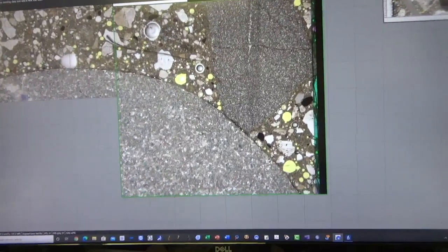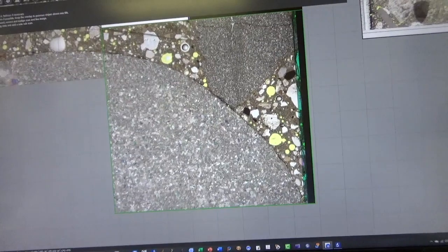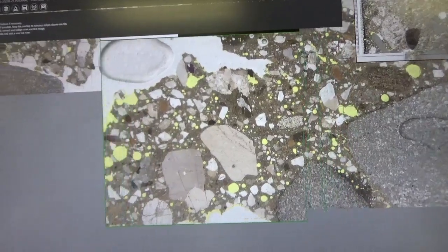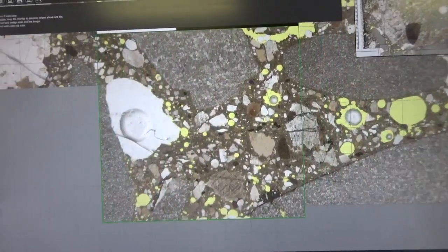Although this manualWSI software will give you a scale bar at the end of the scan, when you save it, it will give you an option to save in the JPEG mode or TIFF mode or JPEG with scale bar. So you can have a scale bar at the end of the scan. But if the image is too big, then you can put a larger size scale bar with the third-party software or ImageJ.